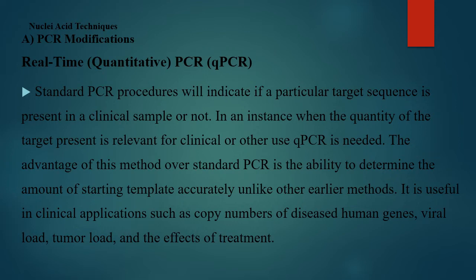The advantage of this method over standard PCR is the ability to determine the amount of starting templates accurately, unlike other earlier methods. It is useful in clinical applications such as copy numbers of disease human genes, viral load, tumor load, and the effects of treatment.